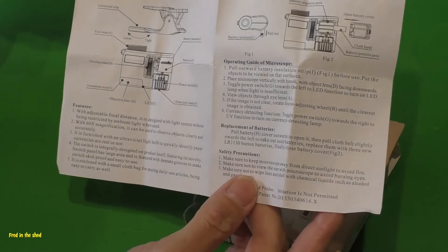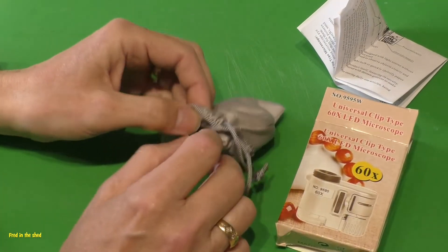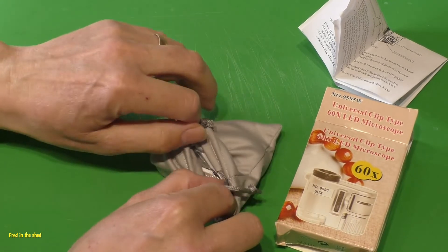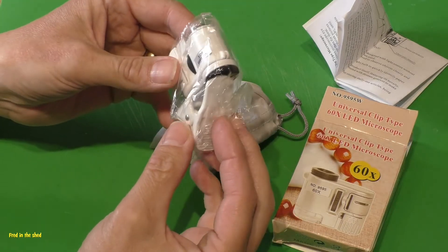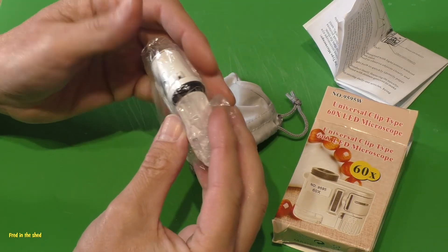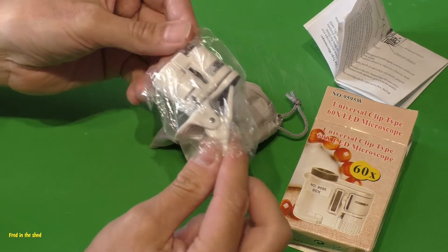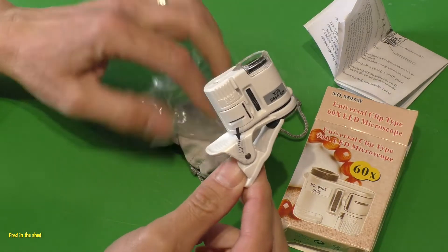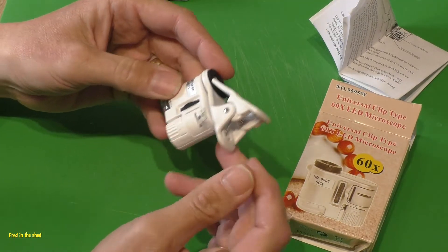Then we've got the microscope itself. It comes in one of these little cloth bags that they seem to send you from China. Here it is, all sealed up in plastic. The whole thing is made of plastic of course - I don't imagine there's any glass elements in this whatsoever, not for three pounds delivered.